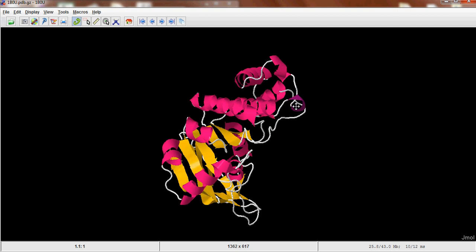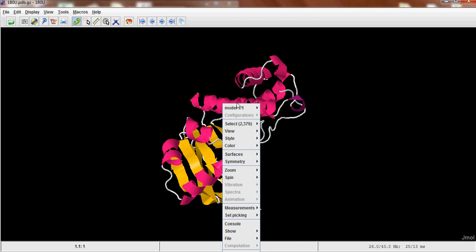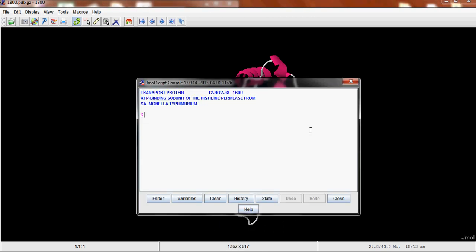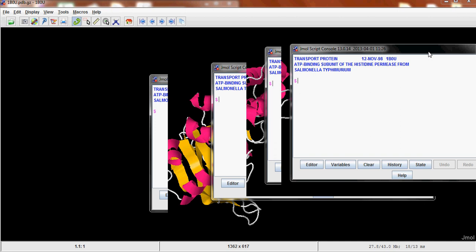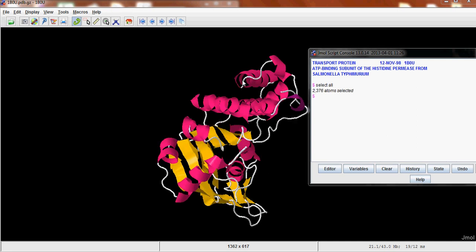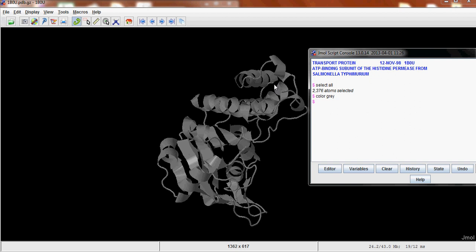You're going to want to make this all grey so that you can highlight and color only the parts that you want. So if you right click and go to Console, you can write Select All. I'm sorry the video bugs a little bit, this app isn't really that great. So you can just go color grey and then everything will become grey.